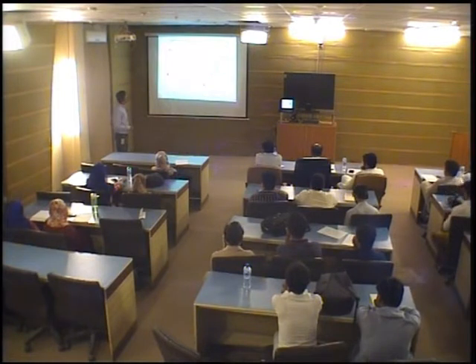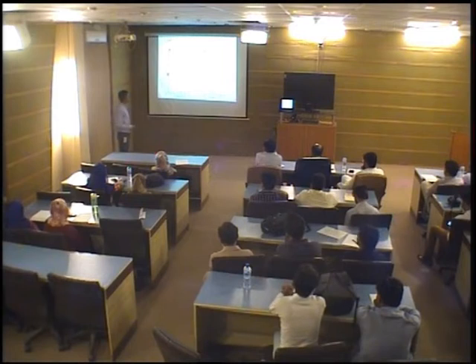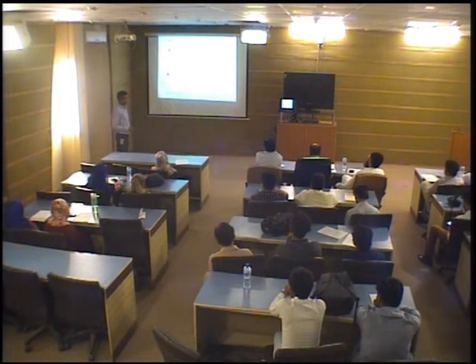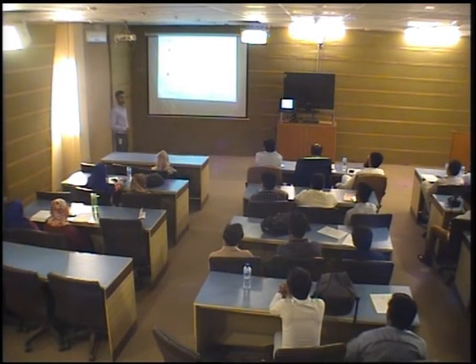In figure A, it ranges from 308 to 380. We have observed almost 4 emission lines and these emission lines belong to calcium. While in figure B, it ranges from 383 to 432. We have observed 3 magnesium lines and the remaining are calcium lines. Figure C ranges from 440 to 489. We have observed almost all calcium lines.